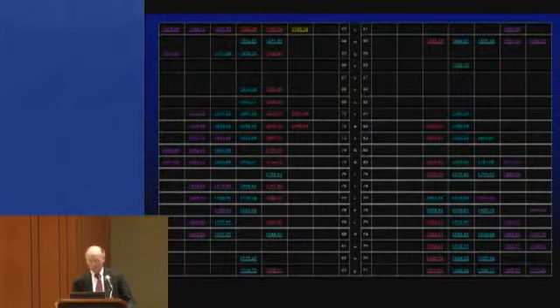Okay, so the bottom line is, if you take a look at this protein, this is what you get without chemistry. You get about 88% of the sequence covered. If we do chemistry on it, we get everything here and here. We're only missing a few residues in here, and we get 93%. We now know how to get these others, and that trick is done by multiple fills of ion packets that contain these missing residues, and they pop right up out of the structure. The reason you don't see them is because they're overlapping with higher charge states, and we can now solve that problem with multiple fills and doing chemistry inside the ion trap.